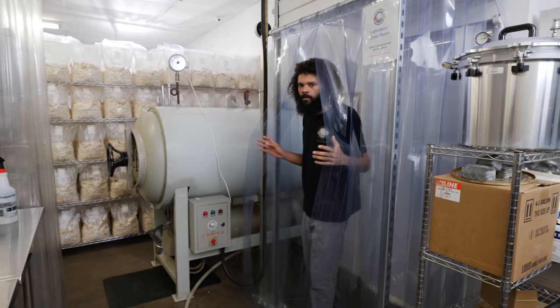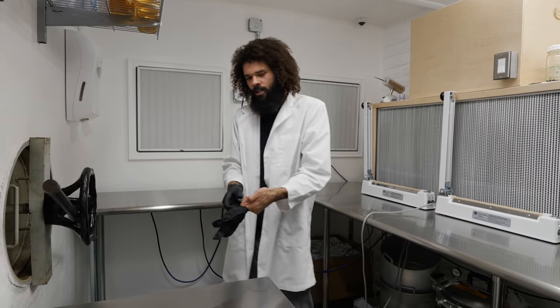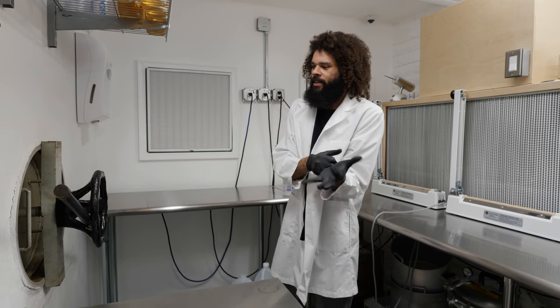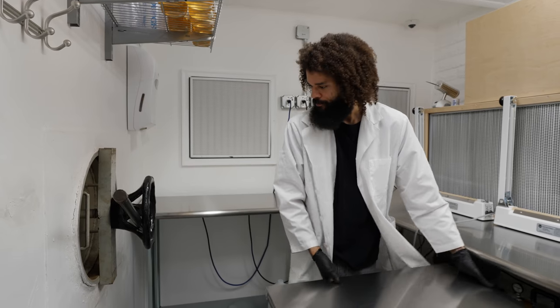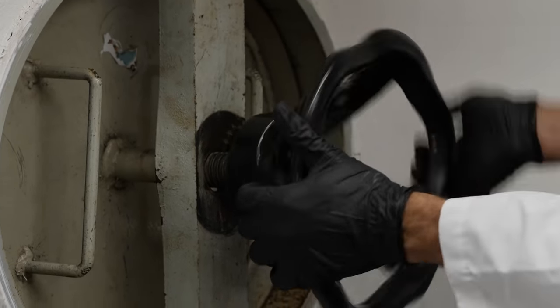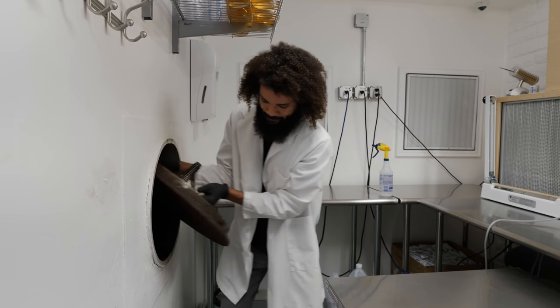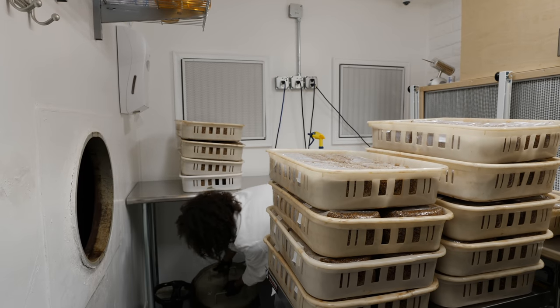So I'll go into the lab and get prepped and ready to start unloading. I'm in the lab now — I've gotten prepped, everything's been wiped down, the room has been freshly mopped, and the autoclave has been depressurized. Now I'm going to go ahead and open up the door.